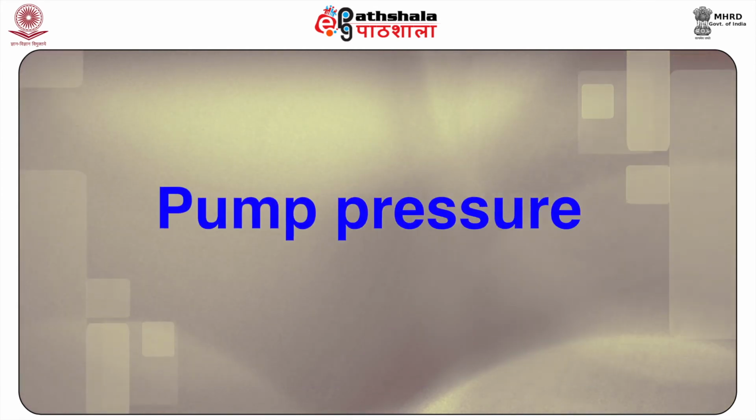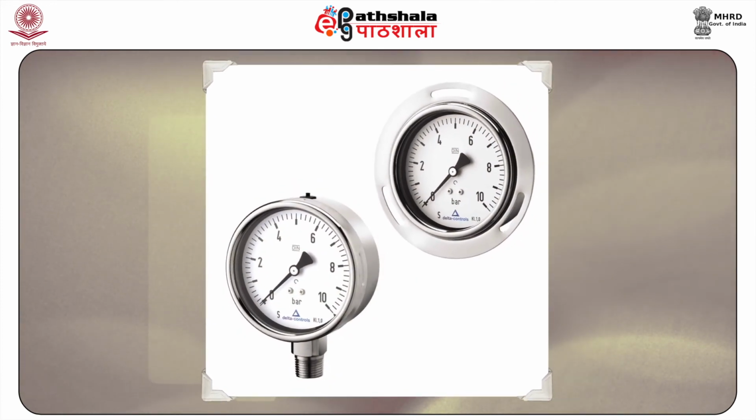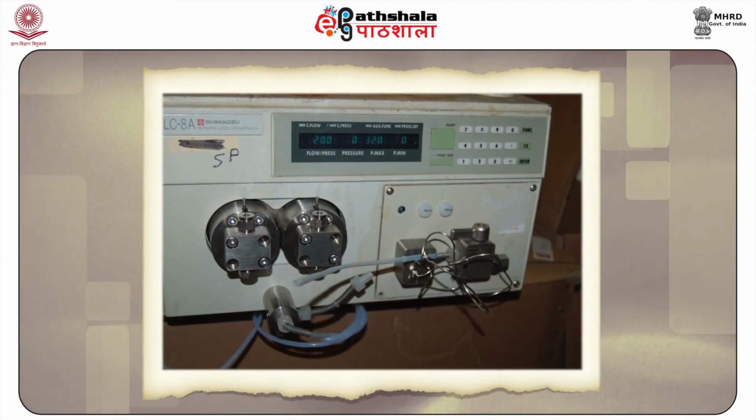Next, moving on to pump pressure. The performance of pumps is measured based on their ability to yield a reproducible and consistent flow rate. It may achieve a pressure as high as about 400 atmospheres. Various improvements have been made to modern HPLC systems to make them work at even higher pressures and consequently much smaller particle sizes, less than 2 micrometers.